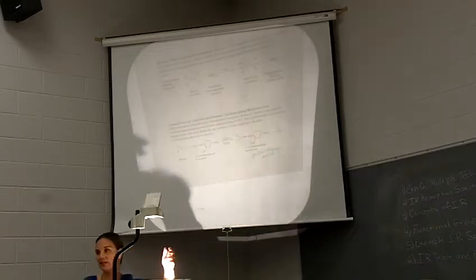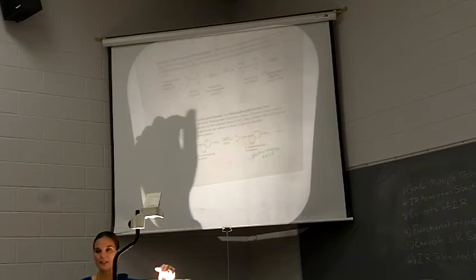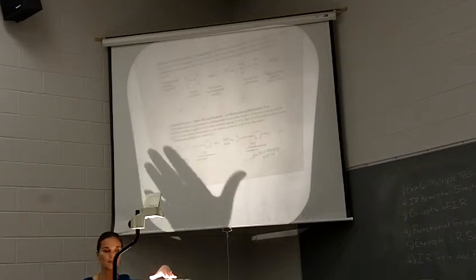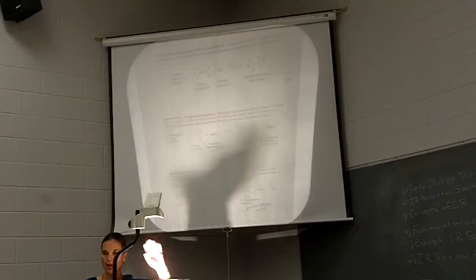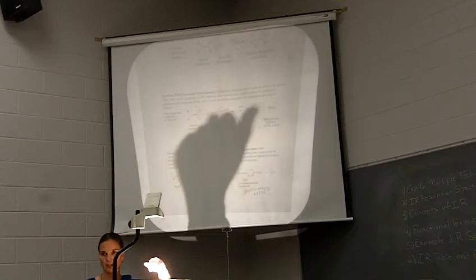Now be careful because what is acetone? What functional group does acetone have on it? It's a ketone, right? So don't contaminate your test with acetone because if you get acetone in here, you're going to get a false positive, all right? Because it will react with the 2,4-DNP. Same with here, be careful not to get acetone in here, because either of these can also react with acetone. So keep acetone out of the equation. Make sure you don't have anything contaminated with acetone when you're trying to do these tests, okay?